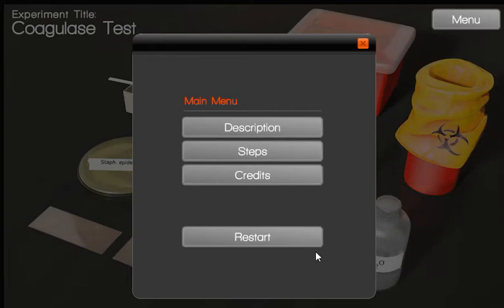The next experiment is the Coagulase test. In the main menu we can see the description and read about the significance of the Coagulase test in microbiological practice and in clinical practice too.